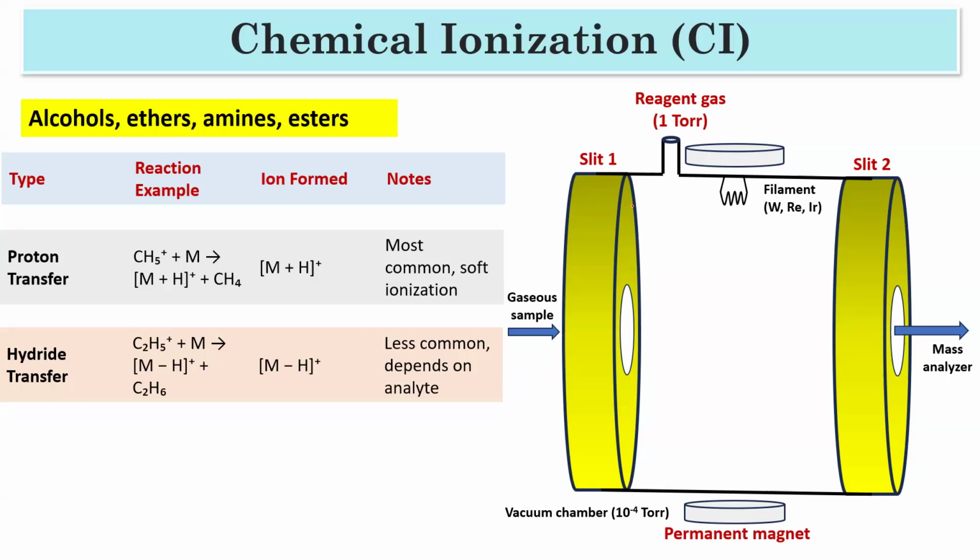Okay, and also I would like to say, sometimes you will see magnets, right? So what is the need of these magnets? Please understand, if electron beams are generated, they should have some purpose to move, right? Otherwise they will maybe move randomly. We want them to move in a controlled manner.